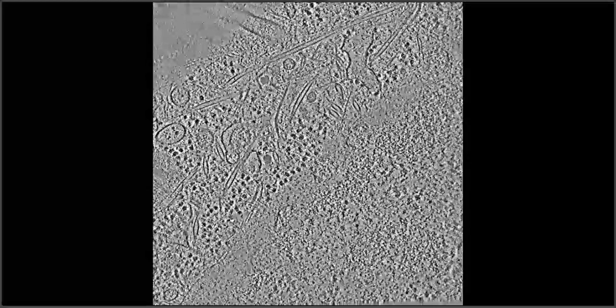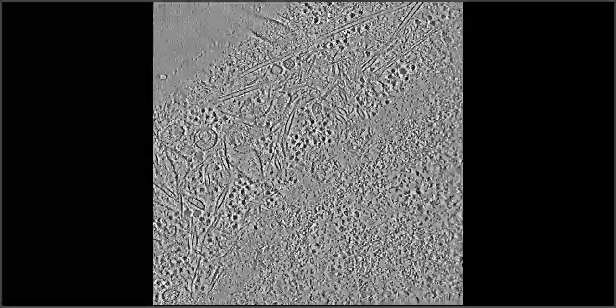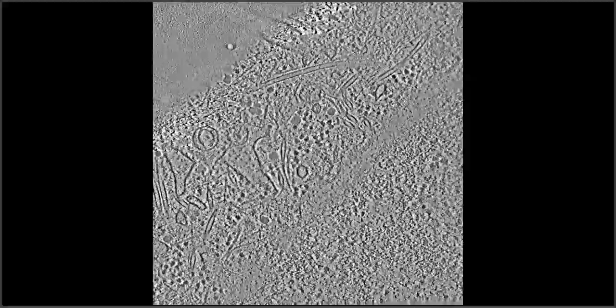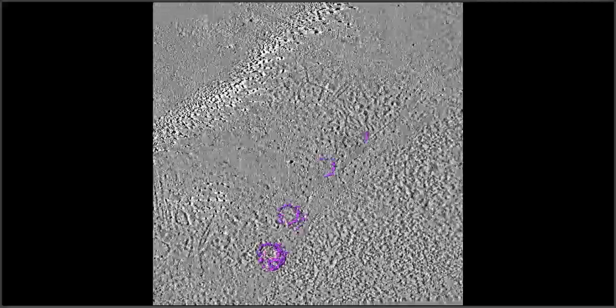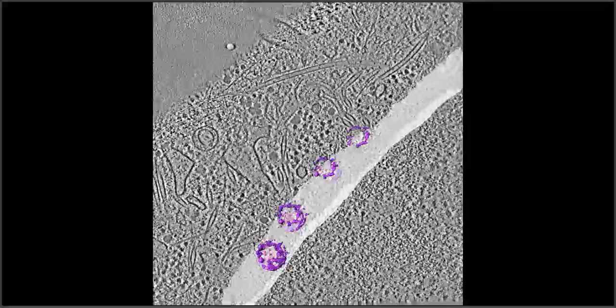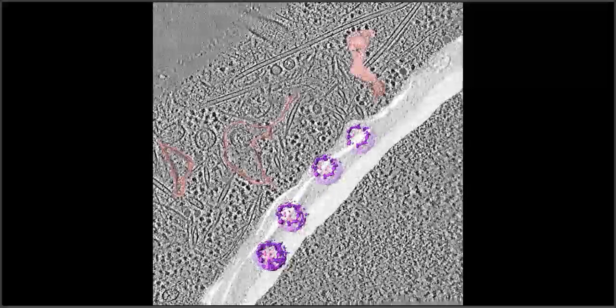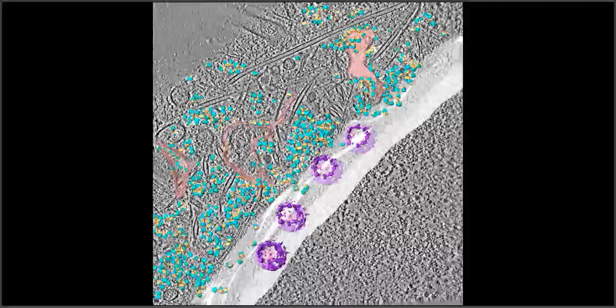So there's the nuclear pore complexes in the membrane, the ribosomes, different membrane components, the microtubules, and then we're going to see the actin and the intermediate filaments pop in. And then lastly, the chromatin. And now we removed the imaging, and now we have a map of all the different components within the cell that we can identify. And so, in contrast to the previous image, here there's no metal coating and this sample is actually frozen in its natural liquid state.